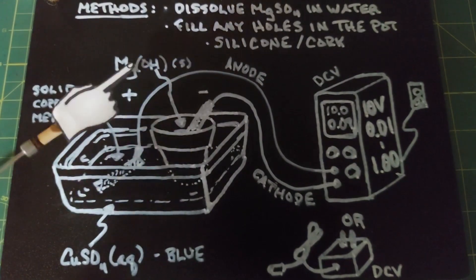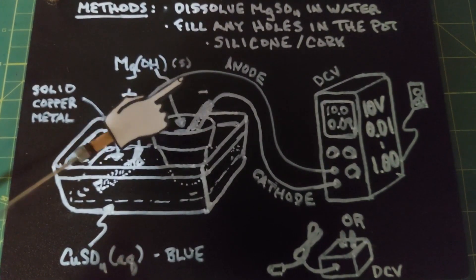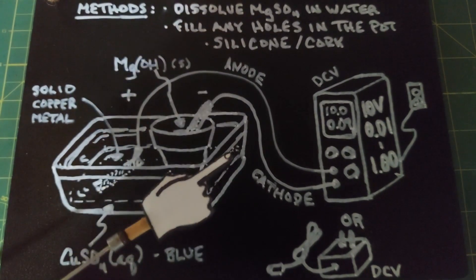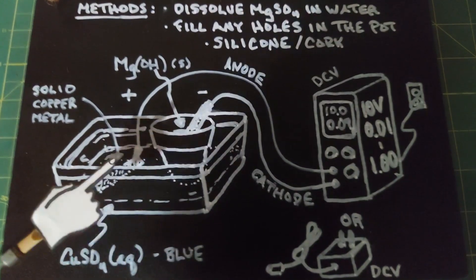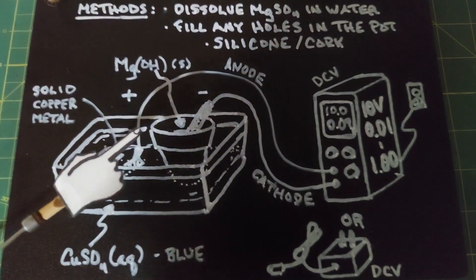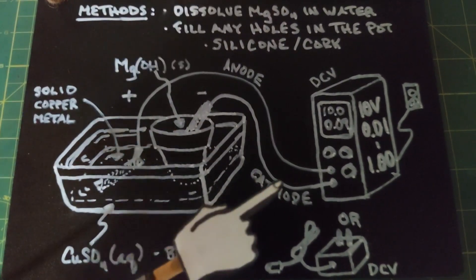Inside the pot, you'll notice the magnesium hydroxide forming, which is a solid — it's not going to dissolve and it's white. This experiment sounds really complicated, but it's not really. Once you set this up, you'll have it sit for days, and then taking it apart and getting the copper sulfate out is actually pretty easy. All right, let's move on and actually do this.